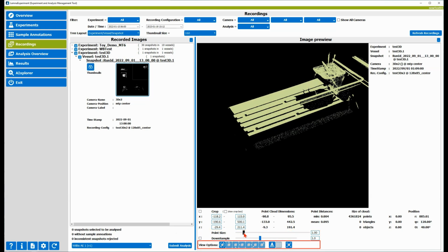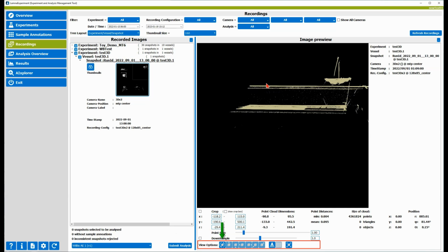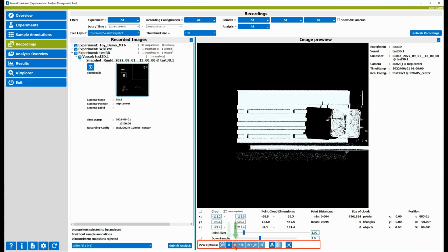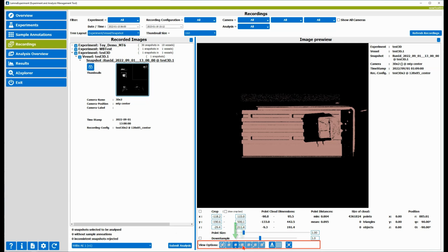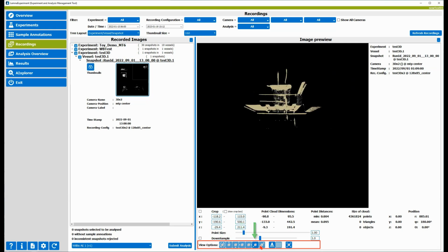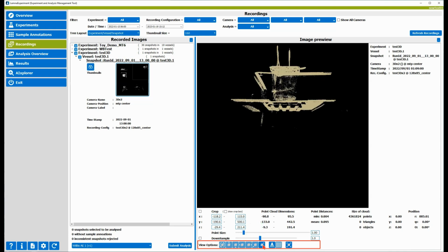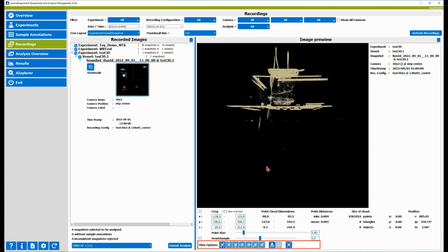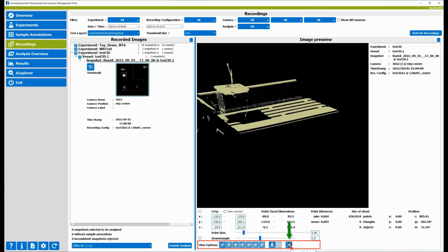In addition, you have a couple of buttons to control the perspective. There is a default free rotating option, the view from the top, the bottom, the left, right, front, and back. In each case, you can switch between camera's perspective and parallel projection. Finally, we can center the 3D object.